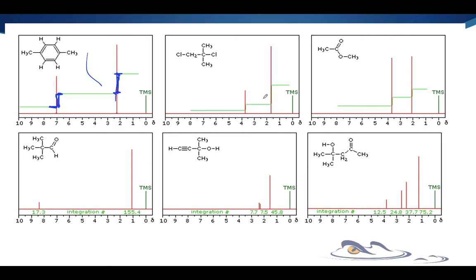This one is integrated as well. So all of these are integrated the same way. And so I'm looking at 2 things. How many environments? I see 1 environment. I see 2 environments. Okay, you say, well, I saw 2 environments over here. That's right, you did. And again, the mistake you don't want to make is to throw the table away. You don't want to sit down and say, all right, well, this one is at about 2.25, so I'm going to go look that up and see what's about 2.25. You don't need to do that. We just need to know how many environments there are.